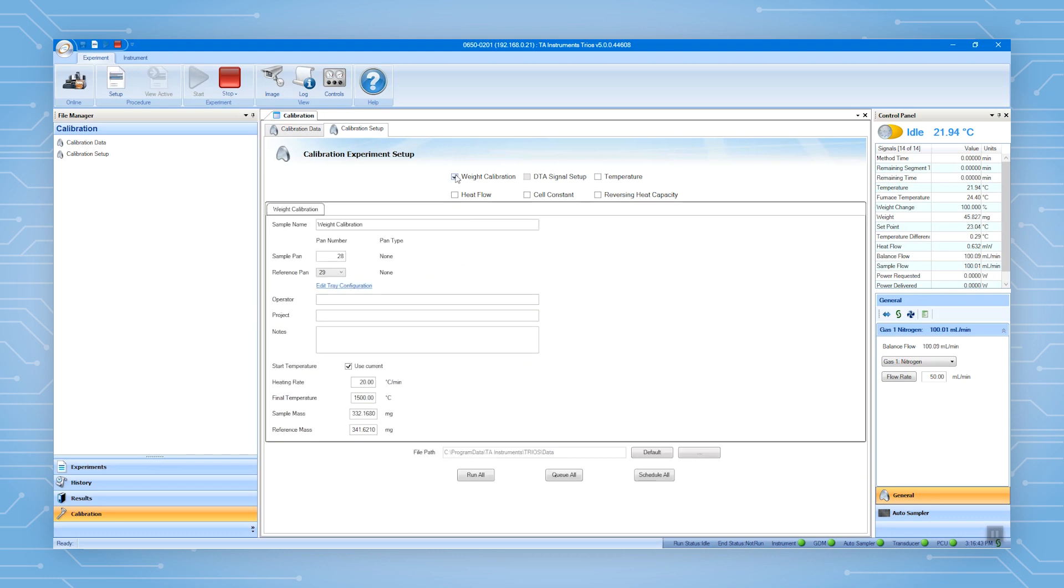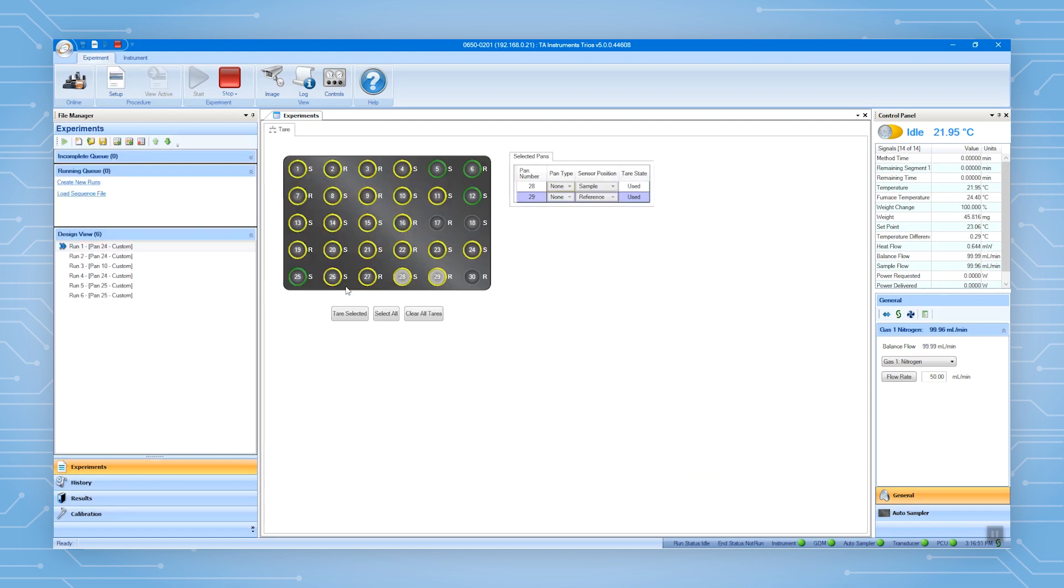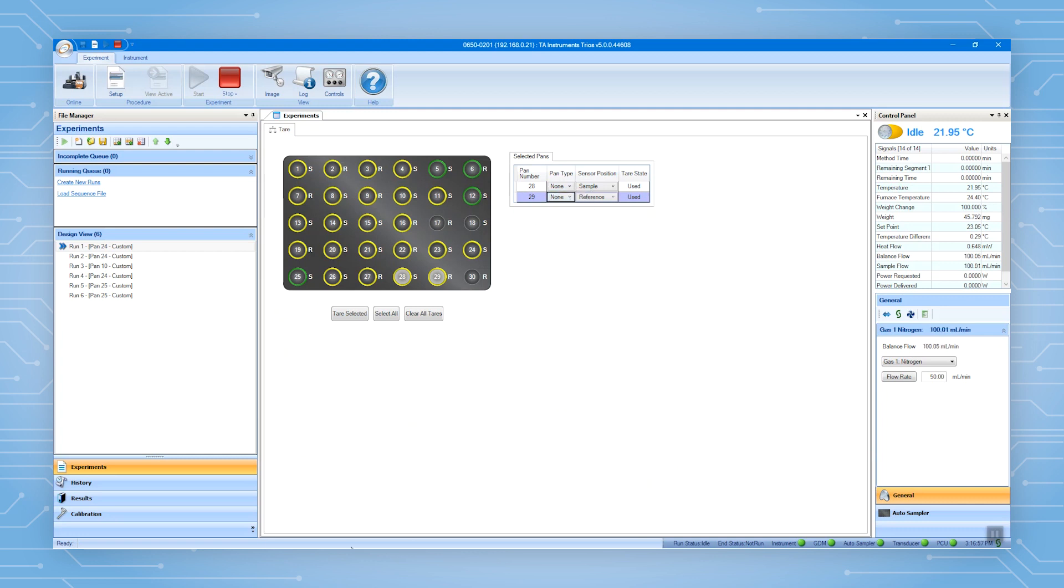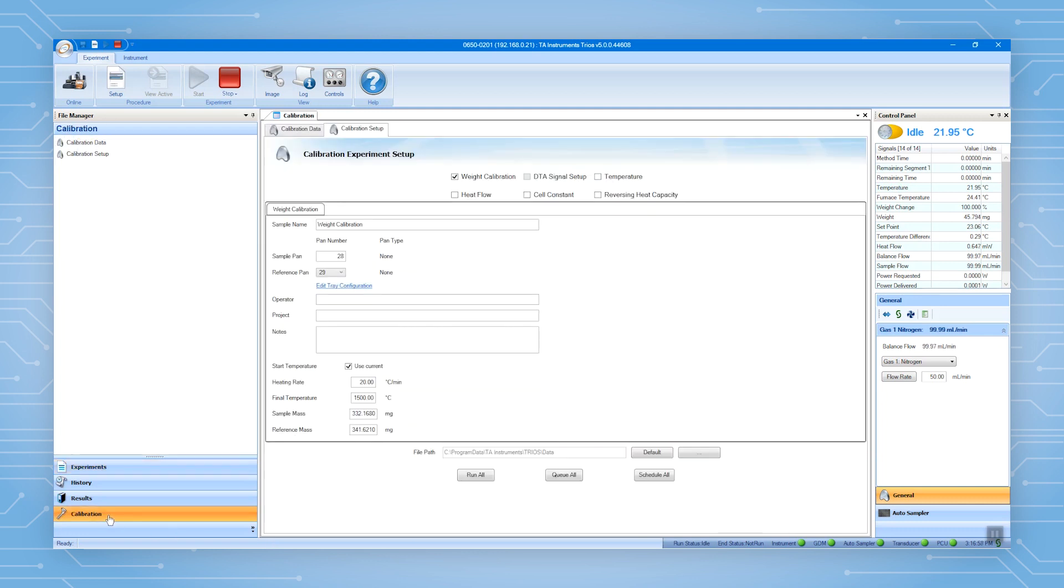Enter the information such as sample name, the tree positions for the two weights. Make sure the pen type is none. You can change the pen type by going to Edit Tree Configuration. You can also insert more information for your tests here.